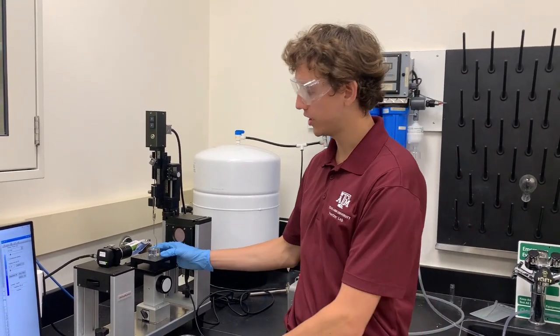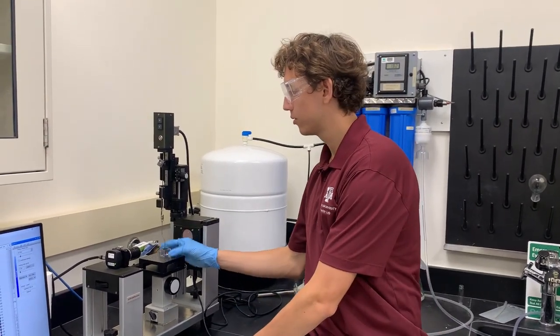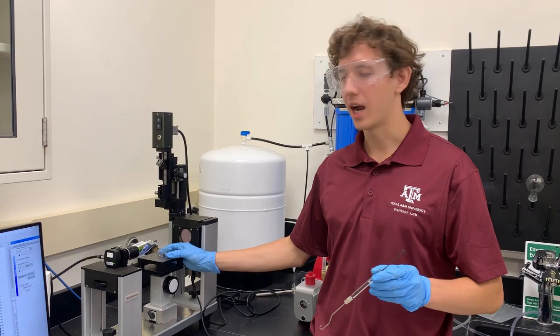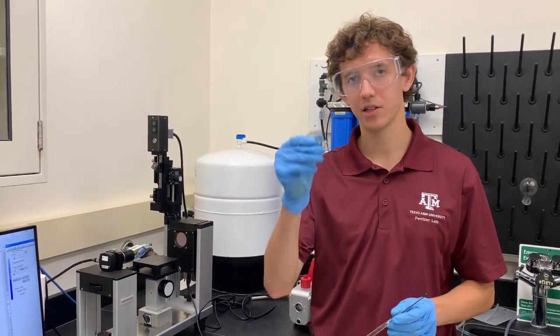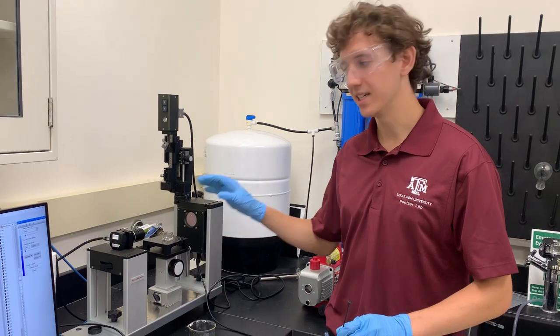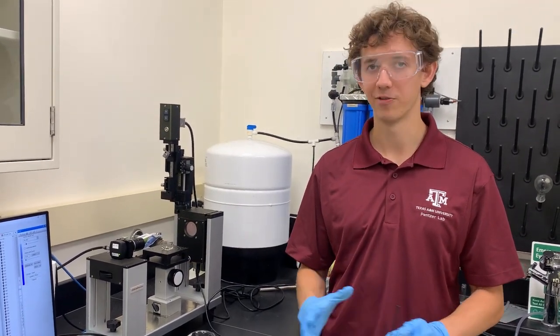After taking your measurement, dispose of your continuous phase, remove the needle and syringe and dispose of any residual fluid. Afterwards, clean your syringe and glass cell with acetone and let them air dry. Power down the instrument and disconnect the camera from the computer, and you're finished.